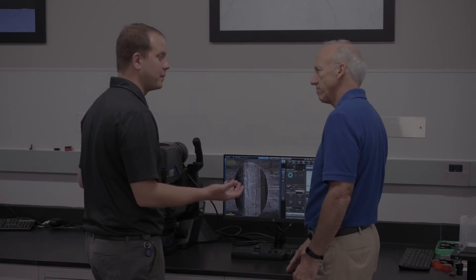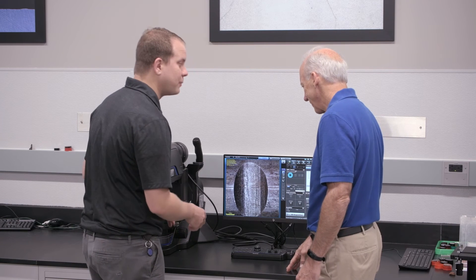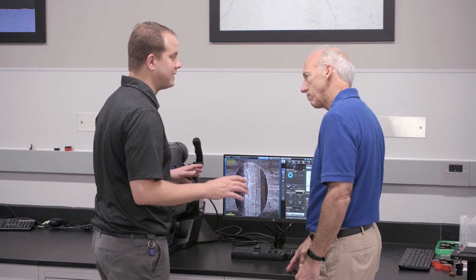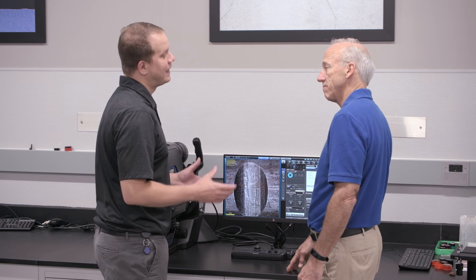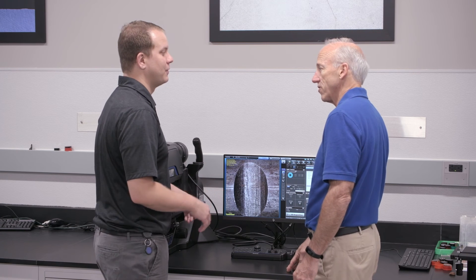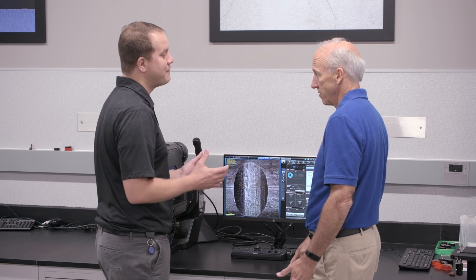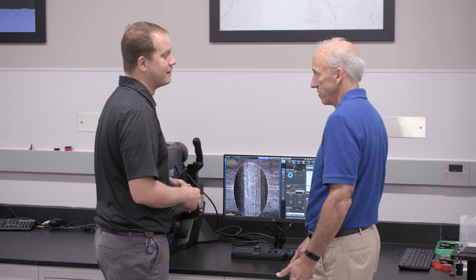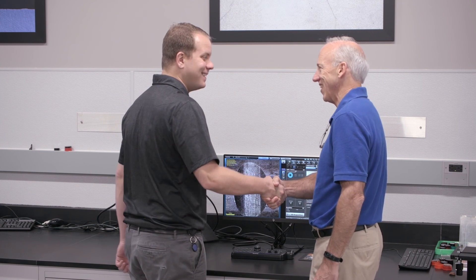Like all of LECO's products, you can expect high-quality customer service and support from our technical sales and service teams that are familiar with your applications and capabilities well beyond the sale of one piece of equipment into your laboratory.